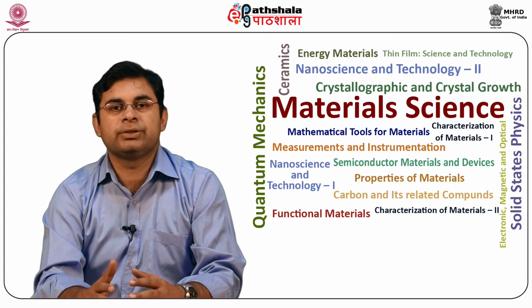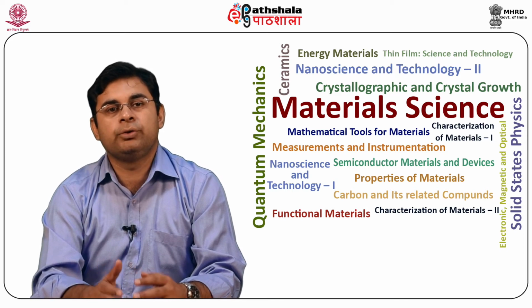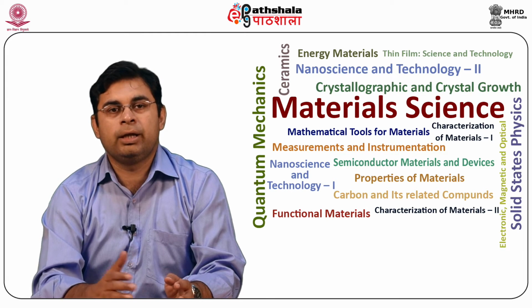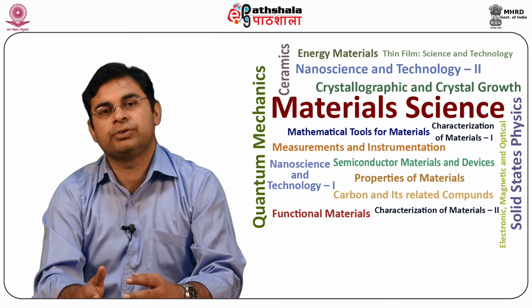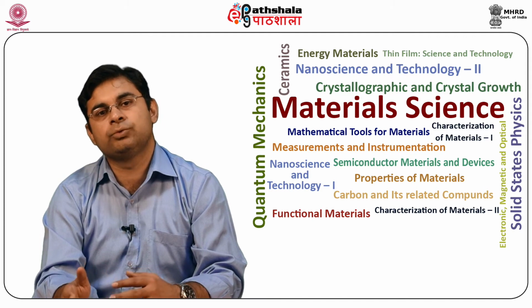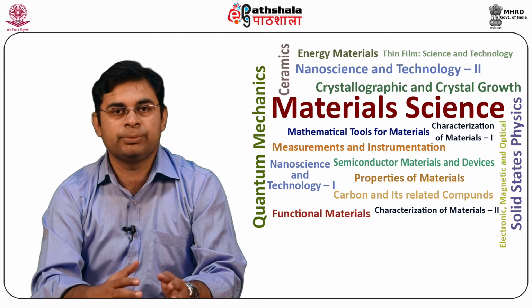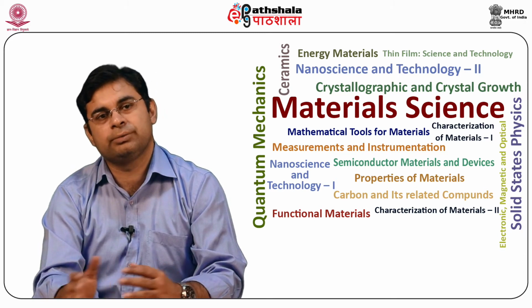Therefore, it is the scattering of the light and electrons that produces an image of a specimen. Here, it is not possible to get a surface profile of the sample that can be used for measuring surface roughness and studying 3D shapes and sizes of micro to nano-sized objects.